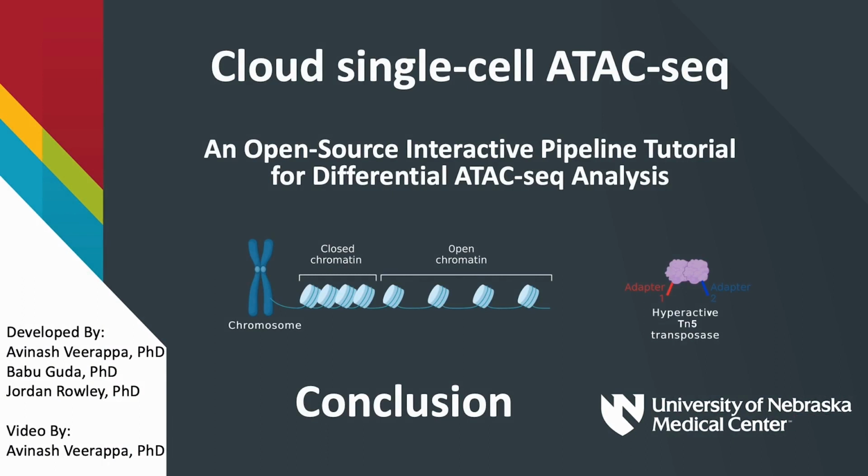In conclusion, single-cell ATAC-Seq is a powerful tool for understanding the complexity of cellular systems and in unraveling the underlying regulatory mechanisms of gene expression. With its ability to provide detailed information on the chromatin landscape of individual cells, this technique has the potential to revolutionize our understanding of disease and aid in the development of more targeted therapies. We are excited to see the continued advancements in this field and the impact it will have on the future of biomedical research.